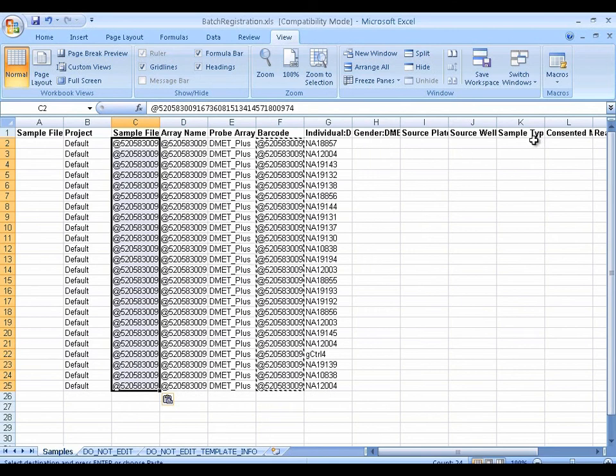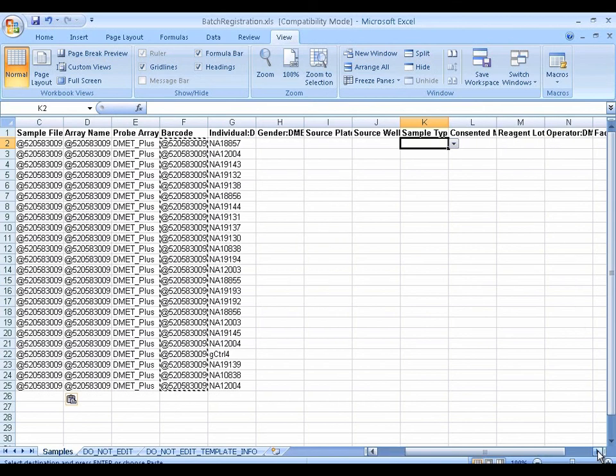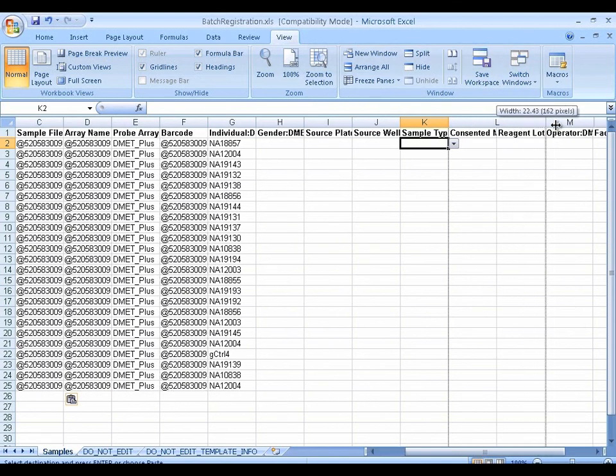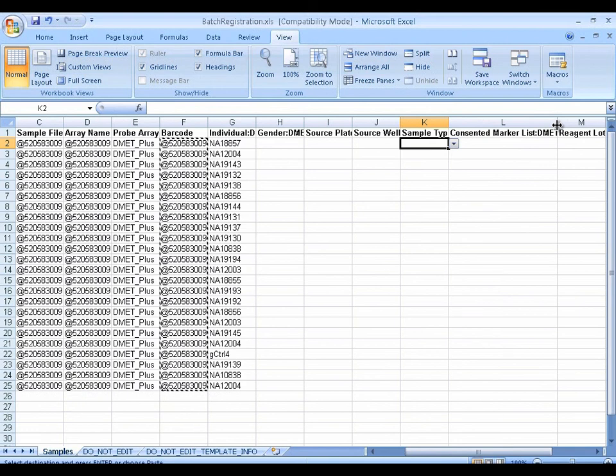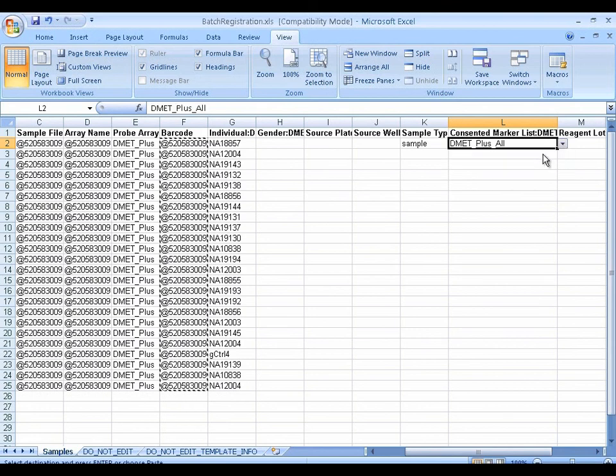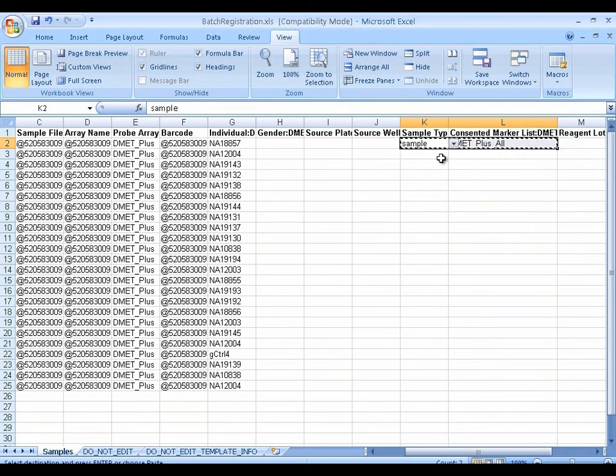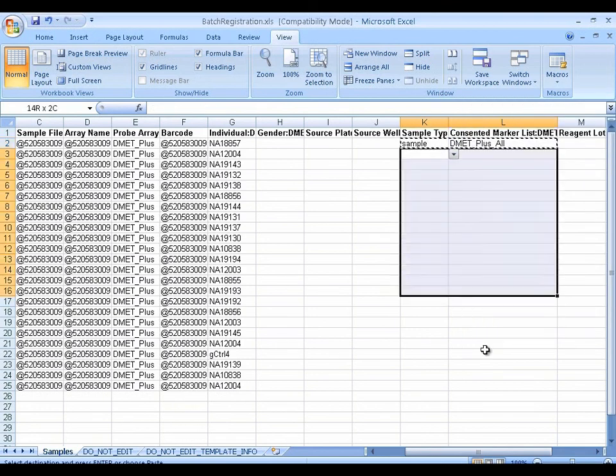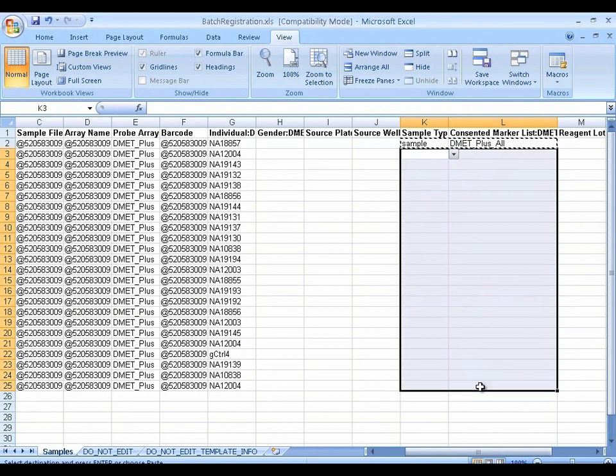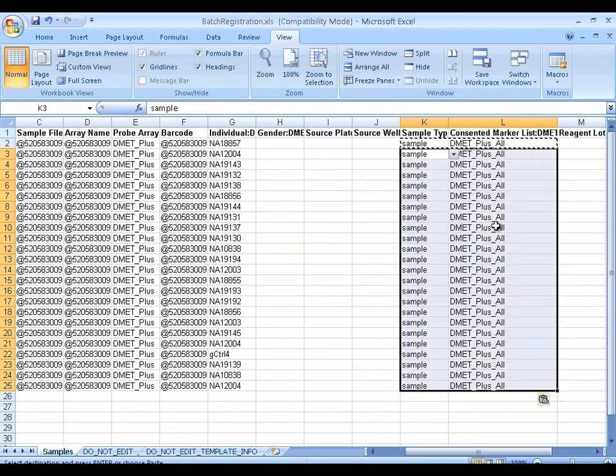And now for the required fields, we have sample type and consented marker list. Sample type, mostly sample, consented marker list, DMET plus all. Let me populate this all.